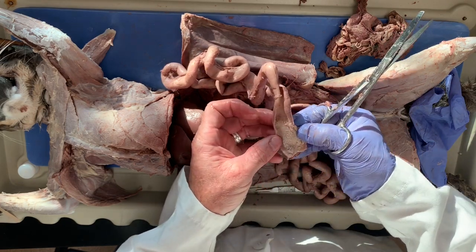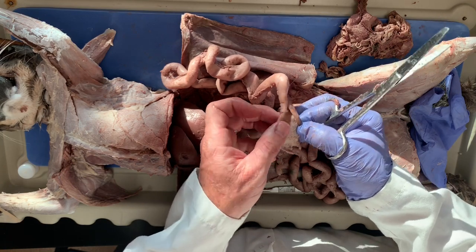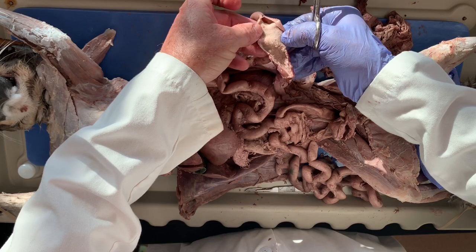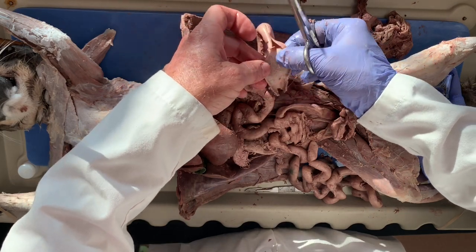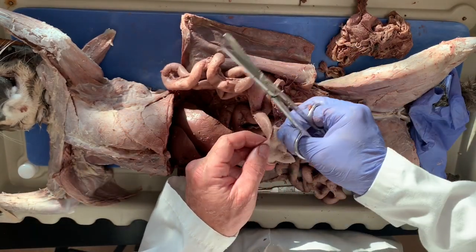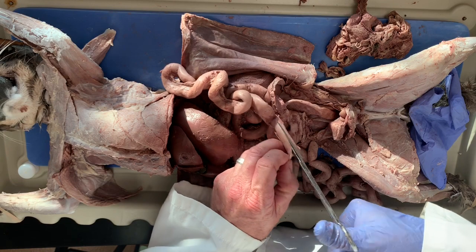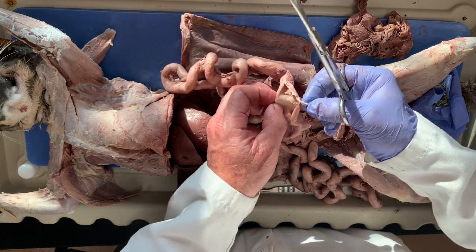Okay, so all of this, it looks like hair and stuff. That's all the villi and microvilli. All these tiny little extensions increase the surface area so we can maximize absorption. I'm not seeing any more, oh, maybe here's some right here. Yeah, there's some more right there. Look at that. That's a tapeworm.